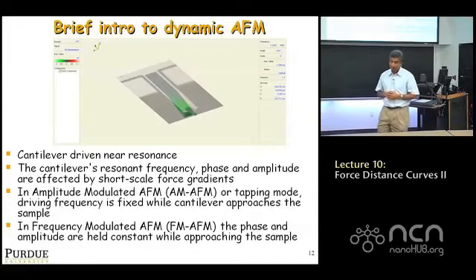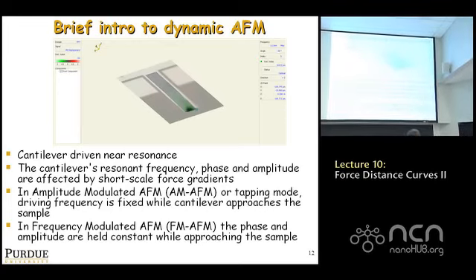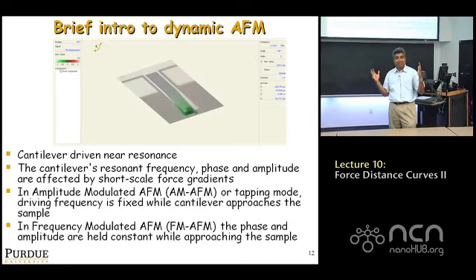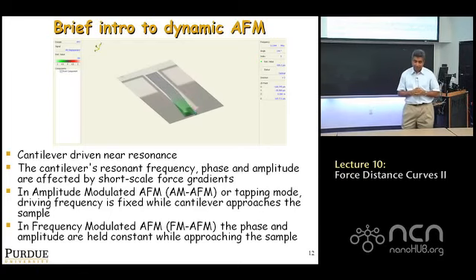However, what ends up happening if you take an AFM cantilever and start shaking it, right? And this is an experimental measurement of how this thing moves up and down. What happens is every cantilever has a resonance frequency and multiple resonance frequencies, just like a guitar string has a first eigenmode, that goes like that. The second eigenmode is more, or you can have an acoustic cavity, very similar things. In the same way, with cantilevers, you have these eigenmodes.